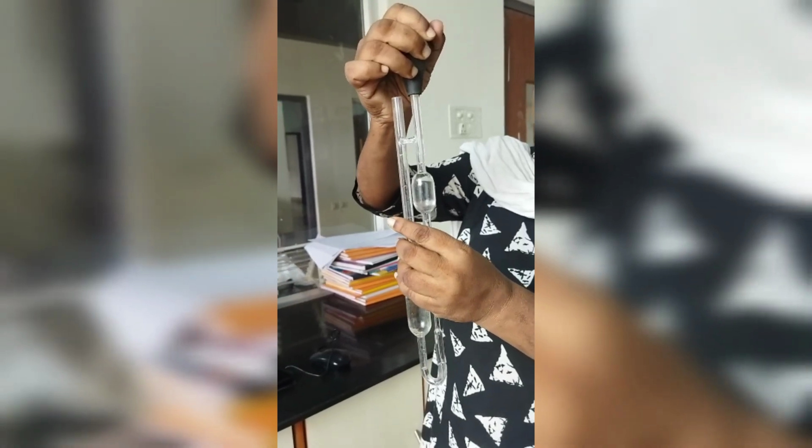The difficult part is drawing the liquid. I have to place this here, I have to push it a little more so that it goes inside. It takes a bit of force. So as I squeeze it powerfully, the air is expelled and that air pushes the water beneath and we'll see the thing moving, and if the force is too much, part of the water will come out. But as soon as you release the force, the liquid will start moving.